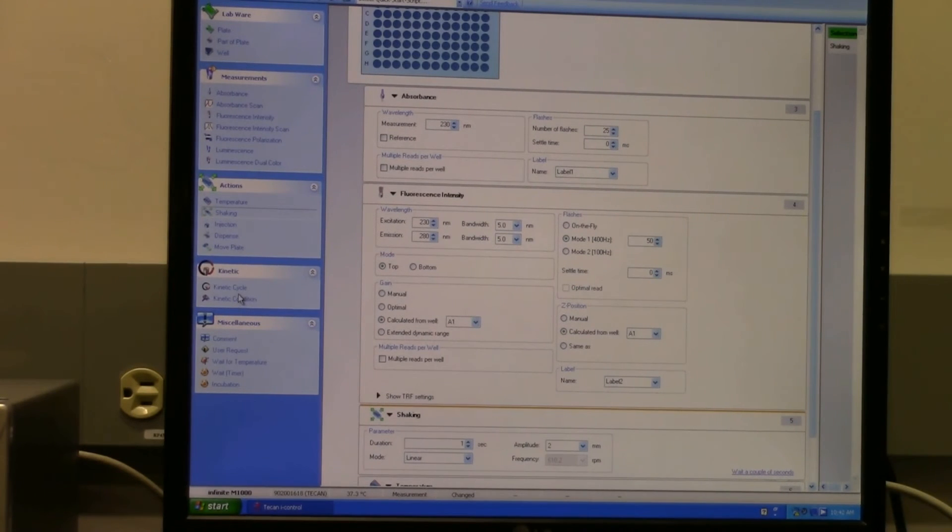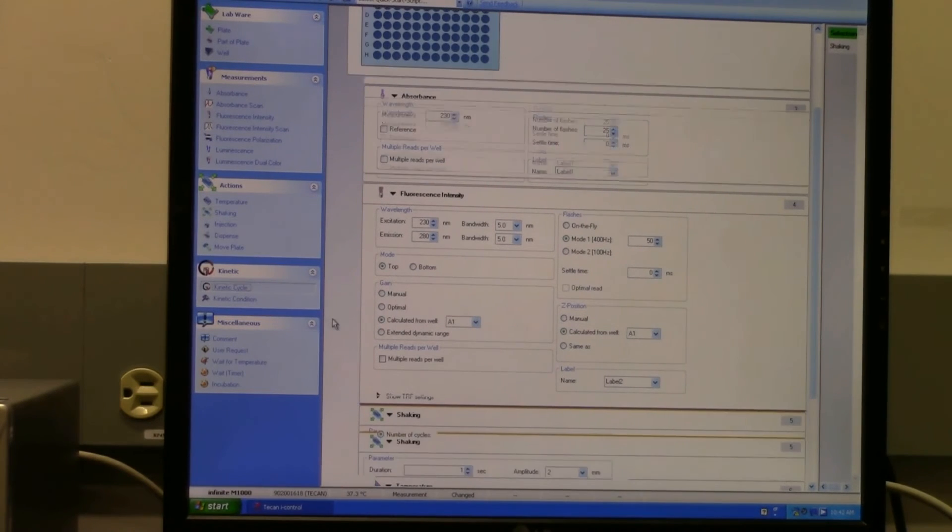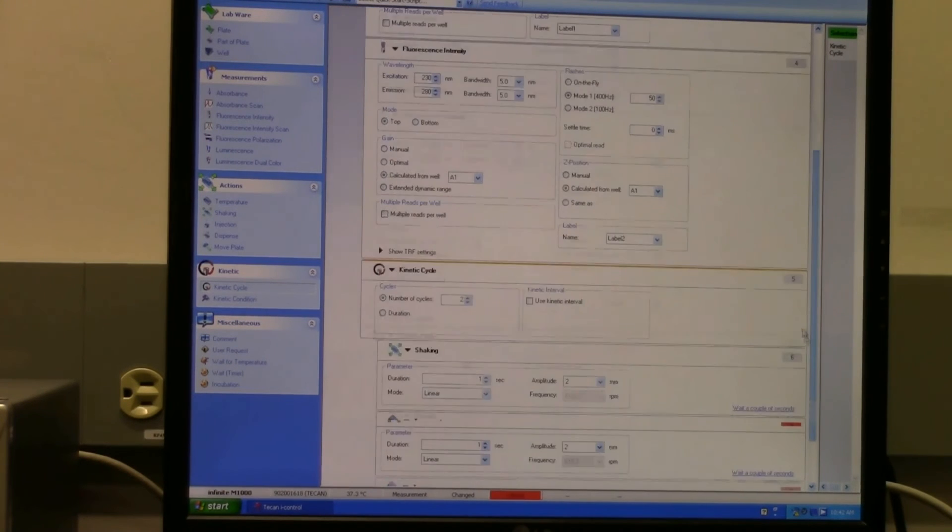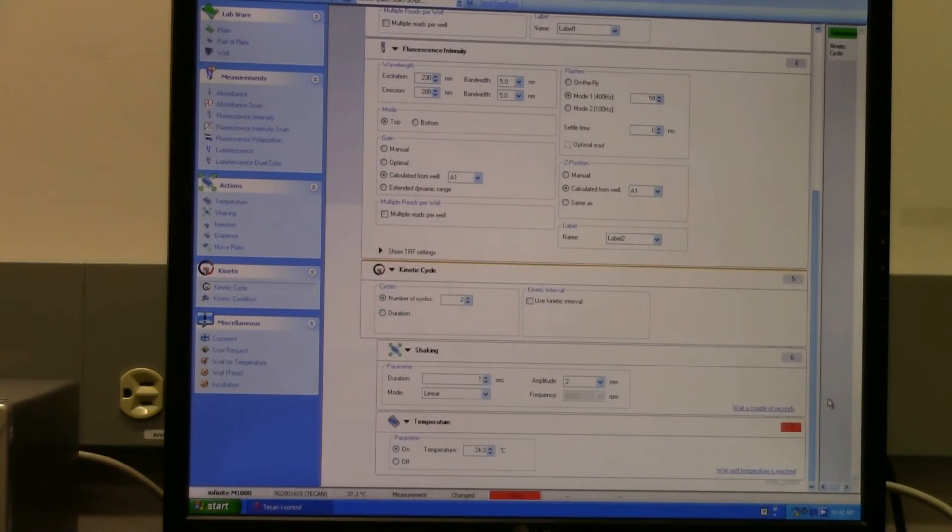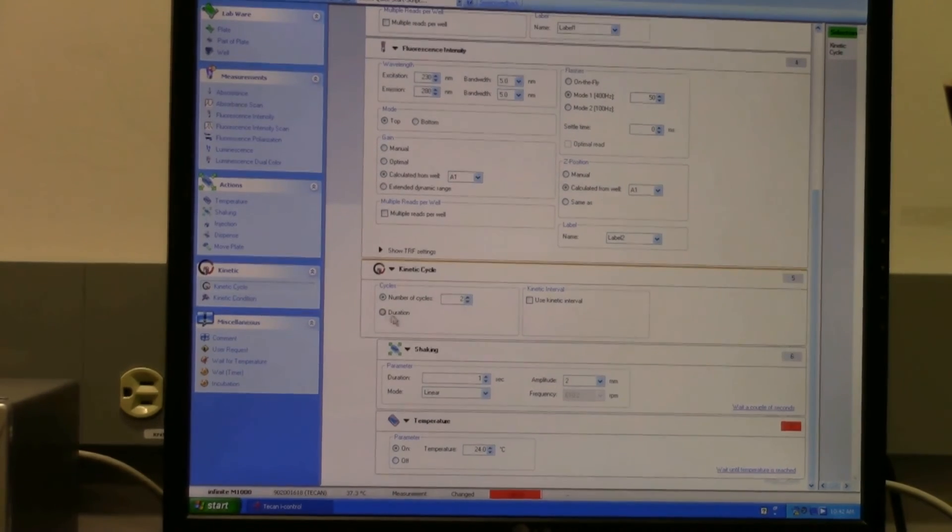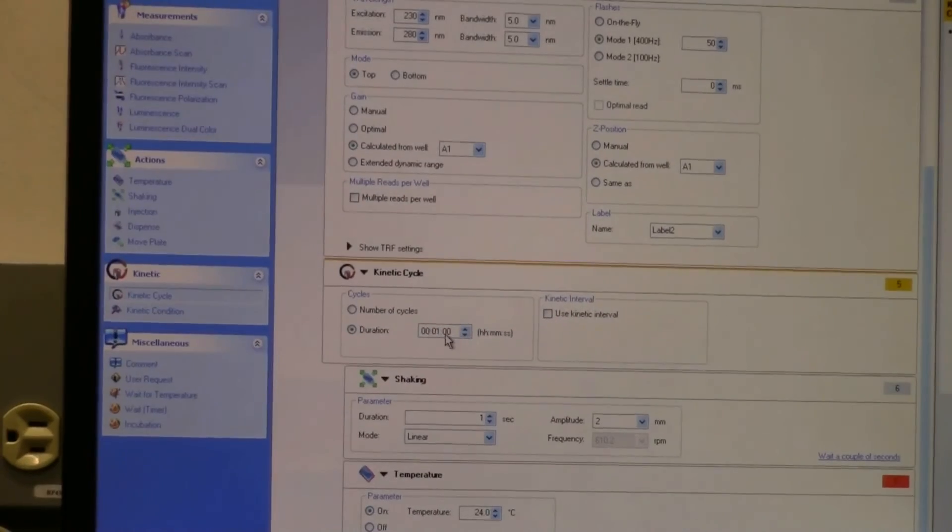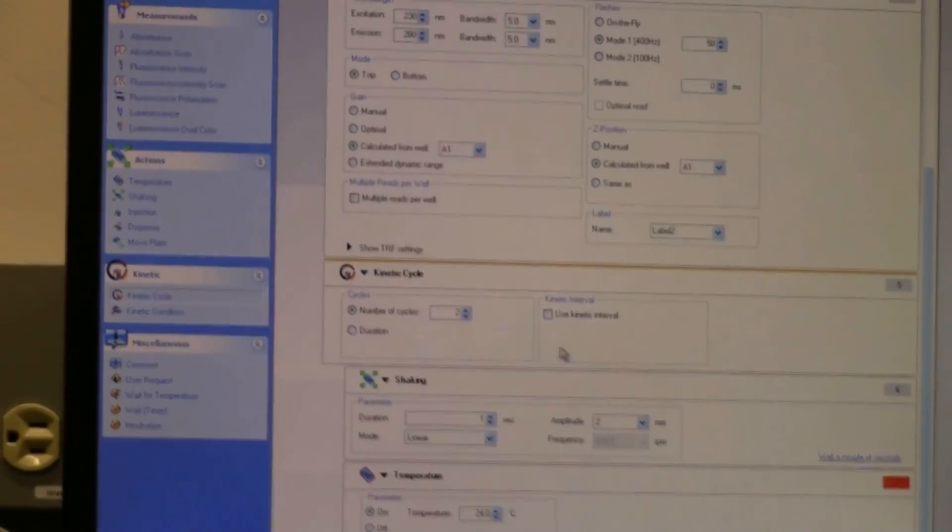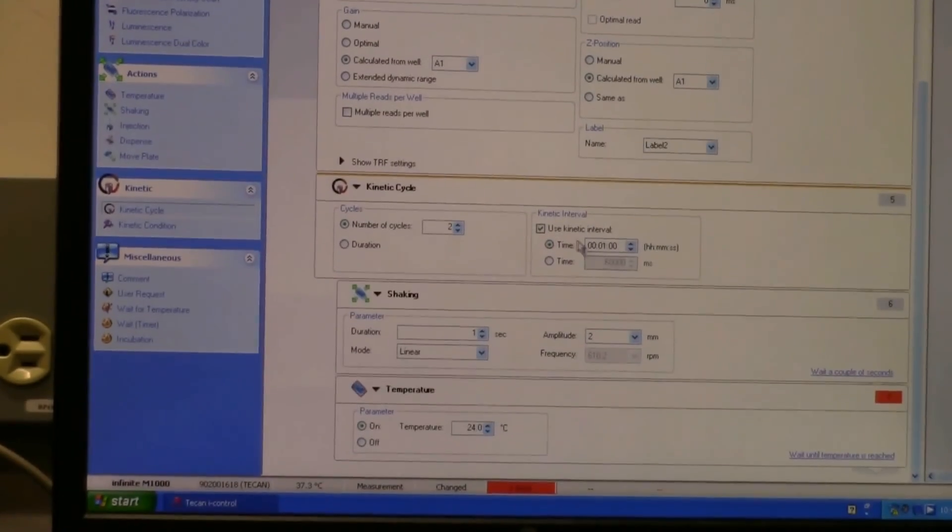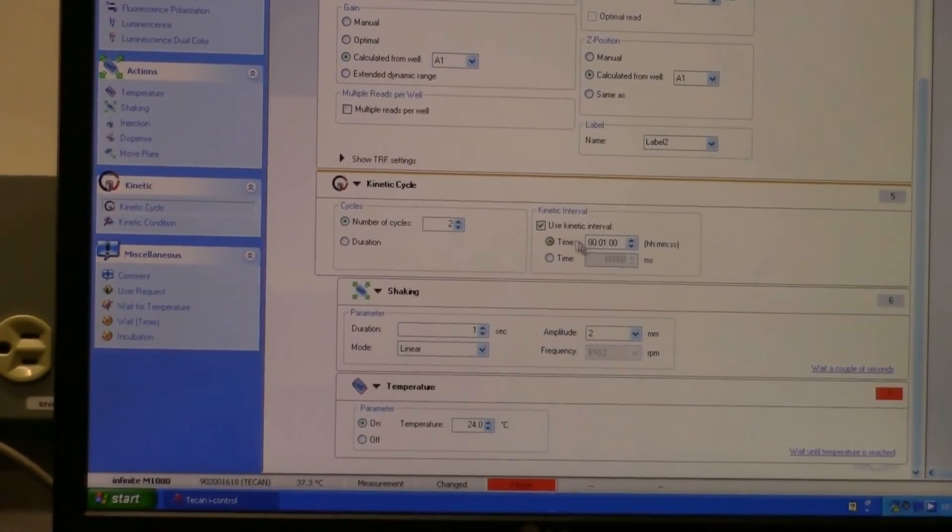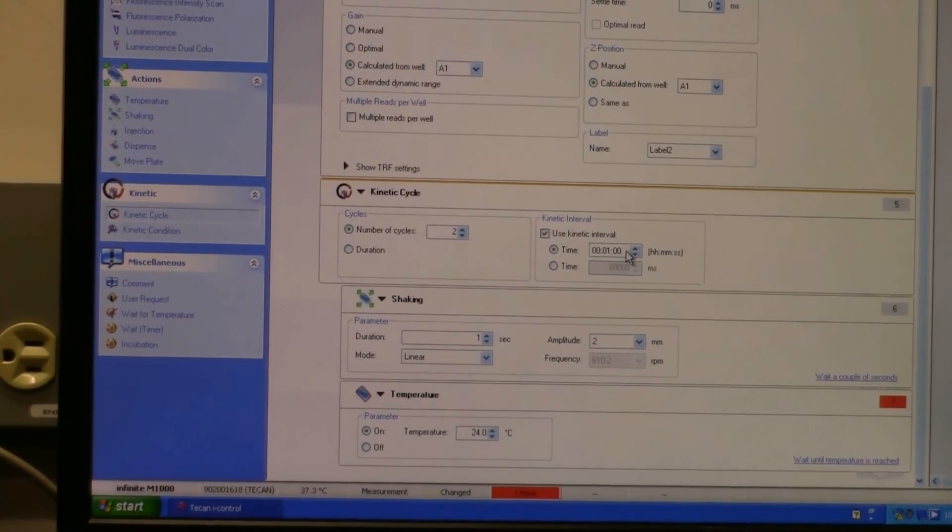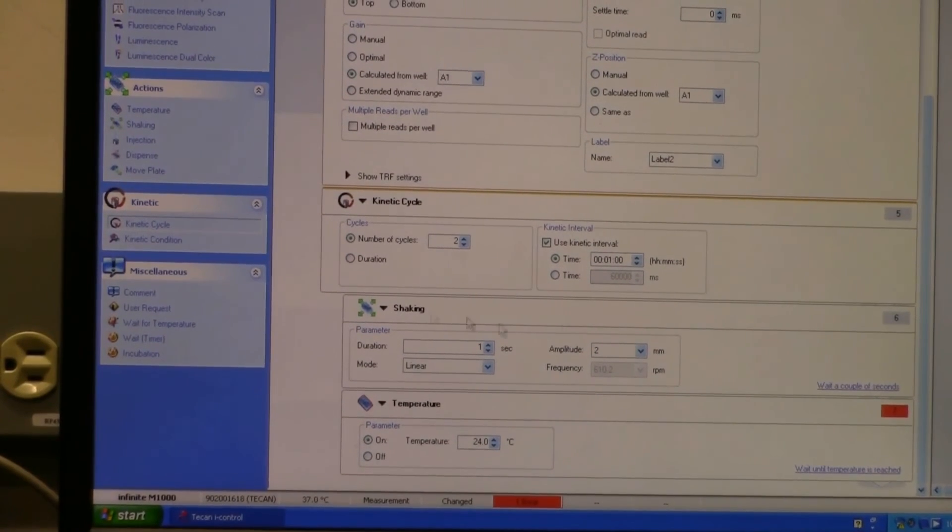So if you're doing a fluorescence read over time, you can drag this into here and set up a kinetic cycle. It's right here. You basically just tell it the number of cycles that you want. You can also set it for duration in time or number of cycles, and tell it which interval you want to use - so how often between reads it's going to read for you.